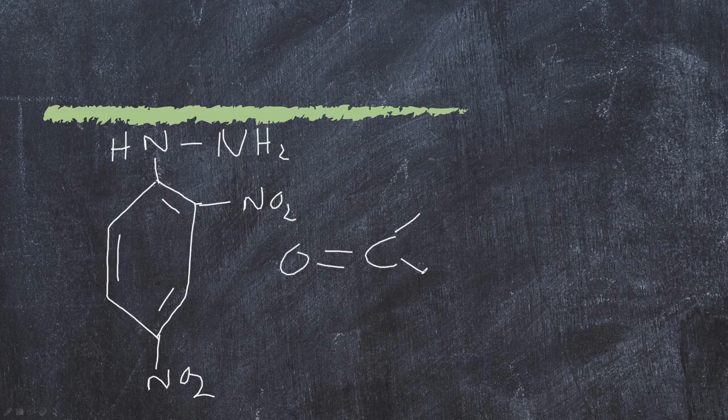I'm not going to put it in position so we can see it at ease, and it will be easy for us to differentiate. Like I said earlier, what's going to happen is a condensation reaction, that's the loss of water. We can see that this H2 present here will end up taking the oxygen from the carbonyl group, and when it takes the oxygen, what's formed is water. That's the simple mechanism of the reaction.